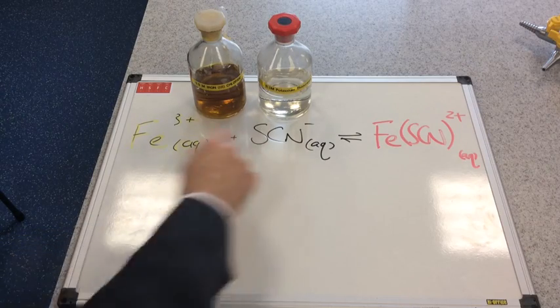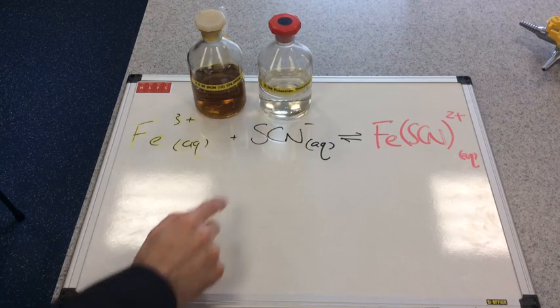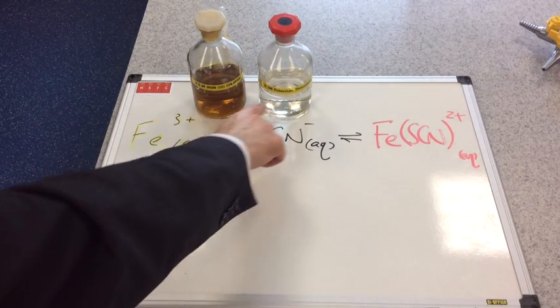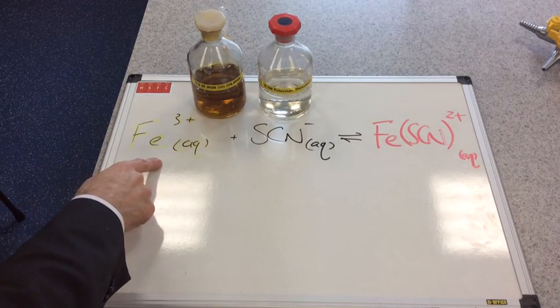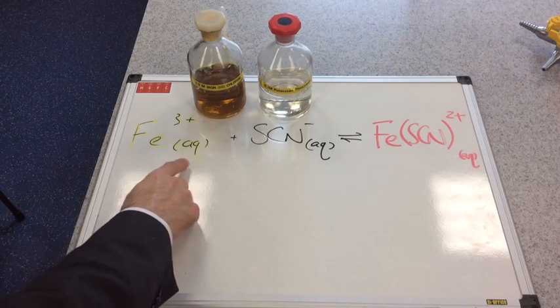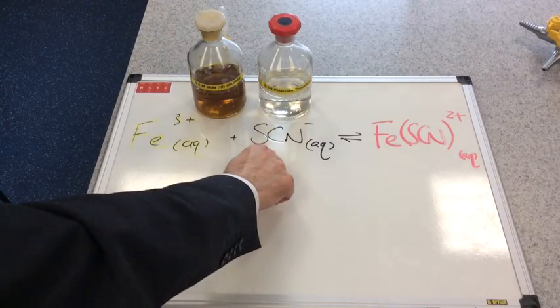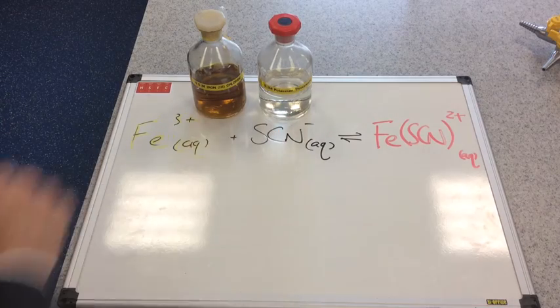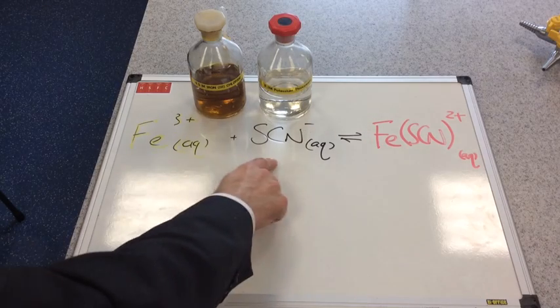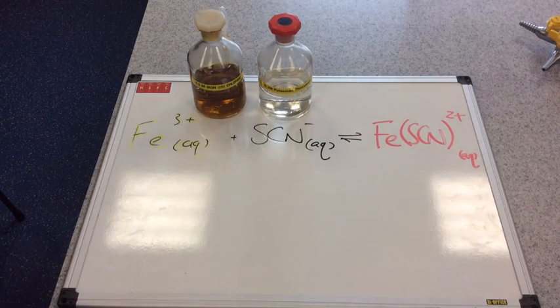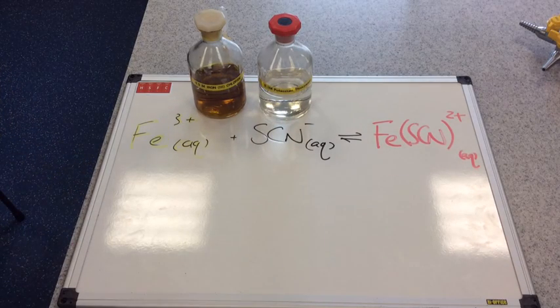You can see from the bottles themselves the iron 3 plus ions are a yellow color, and the thiocyanate ions are obviously colorless. As you'll see in a moment when you add these two chemicals together they produce this ion here and that is red in color.